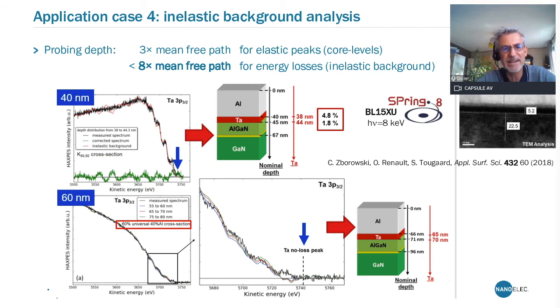So this inelastic background contains information regarding the depth distribution of the element you are interested in. I'm showing you here an example with buried tantalum below a fairly thick layer of aluminum, either 40 or 60 nanometer of aluminum.